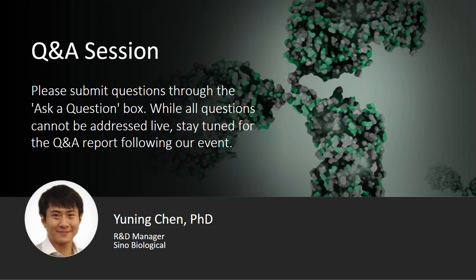So I think the one major difference between the antibodies produced by these cell lines lies in the structure of the glycan, especially the terminal sialic acid decorations. The HEK293 and CHO will have different levels of sialic acid in their antibody glycan, and these sialic acids might be connected to the glycan backbone via different linkages, and sometimes these could be issues in some of the assays.